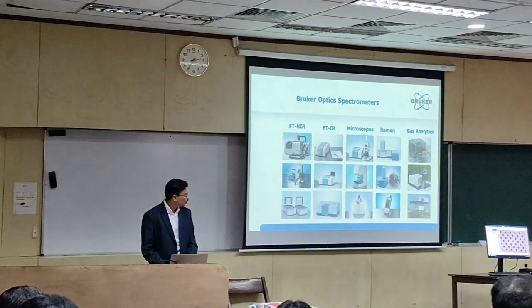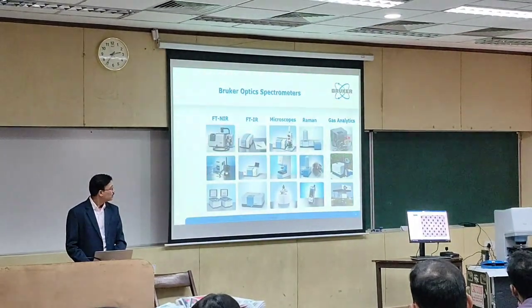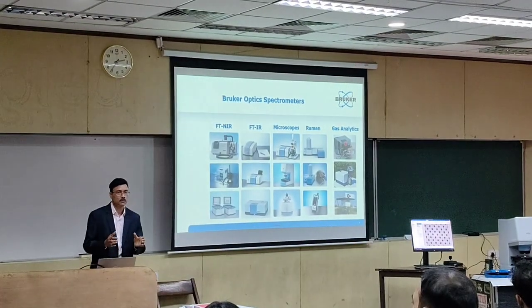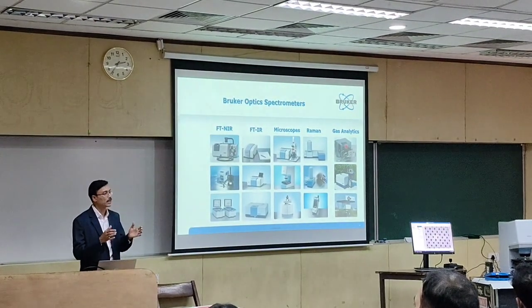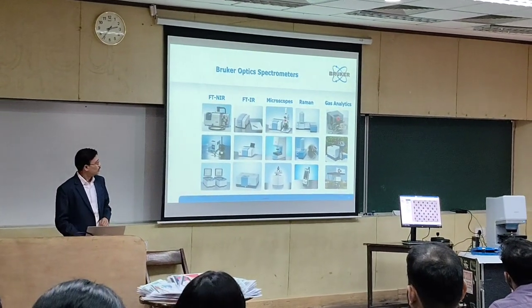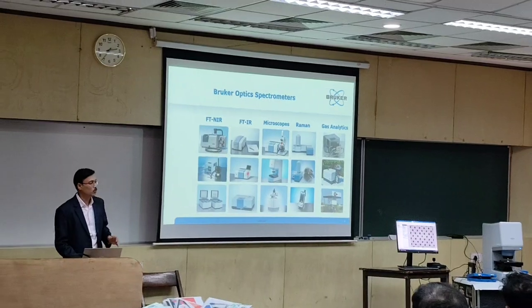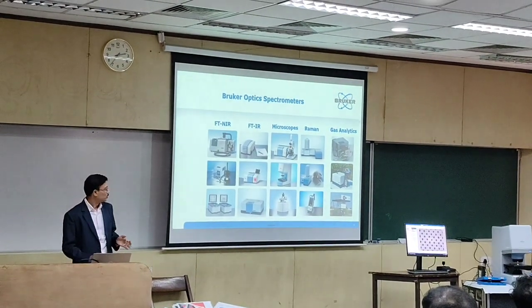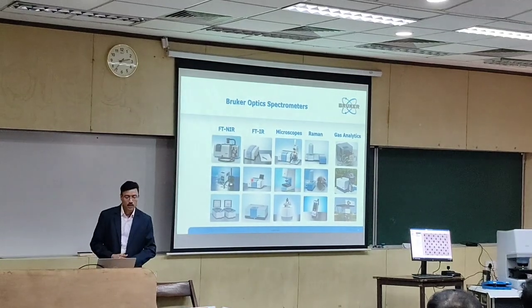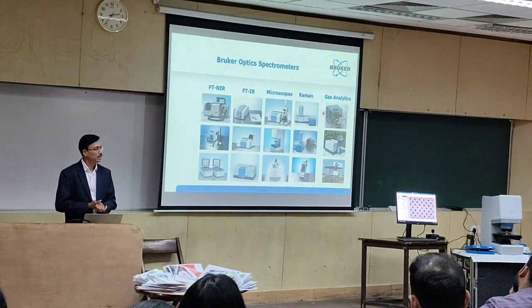And then the other two. When we couple it with a thermo system... No, this is actually independent, the FTIR system for gas analysis only. Evolved gas analyzer, actually, that FTIR we have to connect. So EGA coupling and all, we can do there. But this is a specifically dedicated gas analytic system.